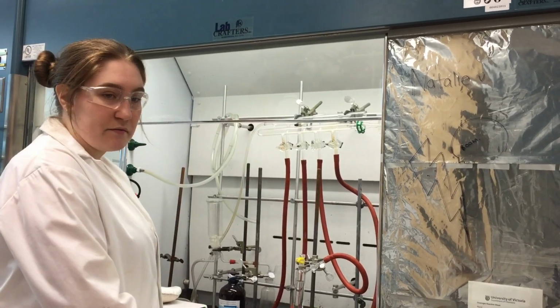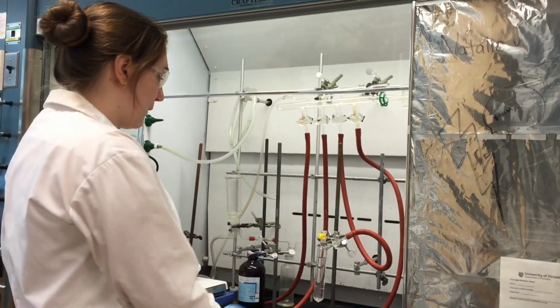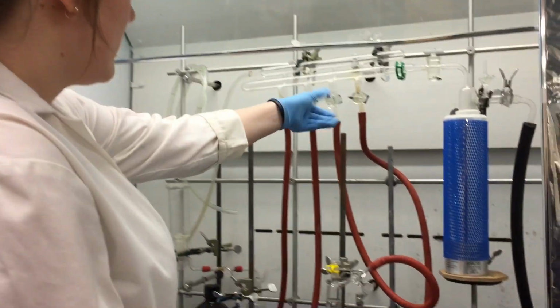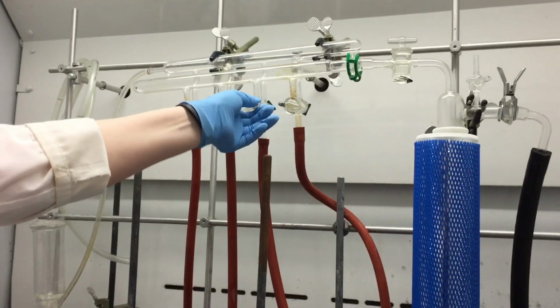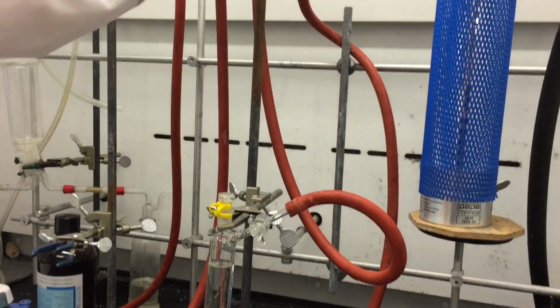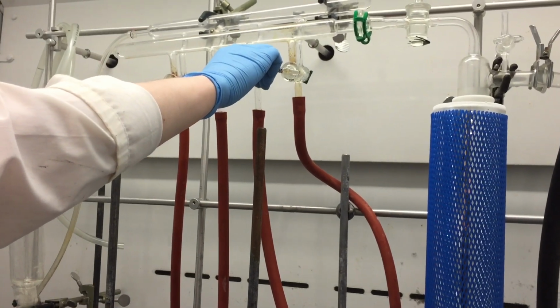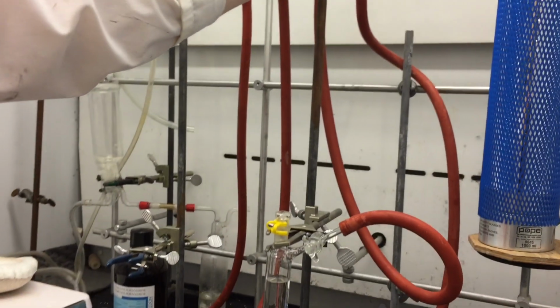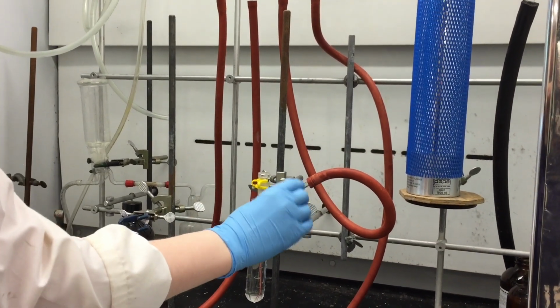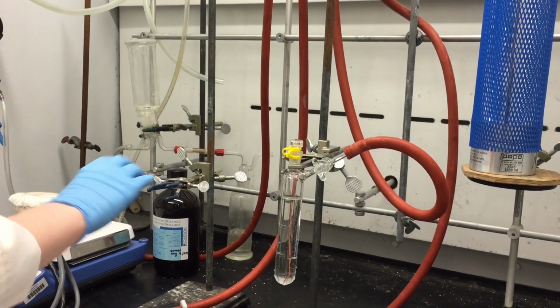We've done 3 cycles of the freeze pump thaw, and we've let our solution come to room temperature. It's a liquid again. We're going to slowly introduce a nitrogen atmosphere. The way we're going to do this is we're going to switch our Schlenk line to nitrogen. We're going to make sure this is closed. When we open up this tap, we want to do this very, very slowly. I've turned the nitrogen up just a little bit for this part.